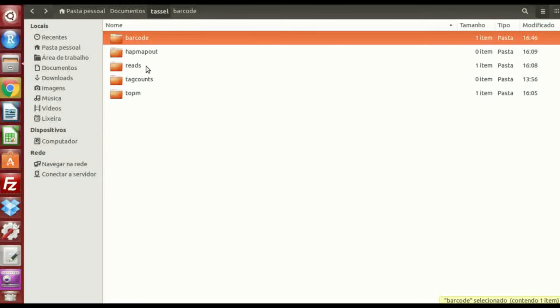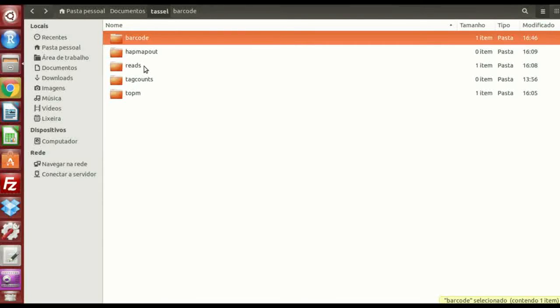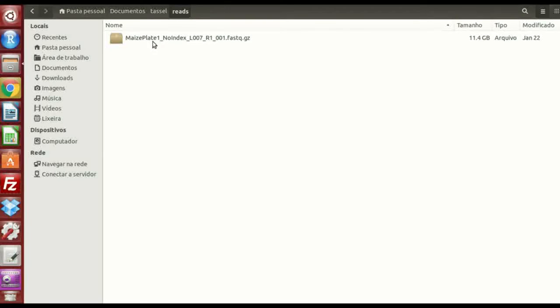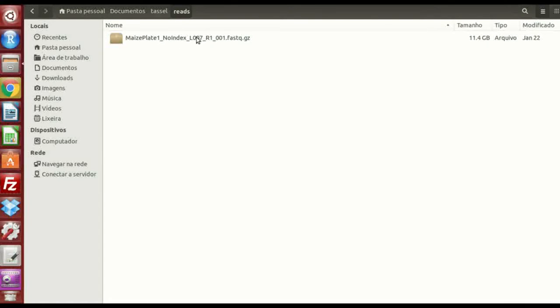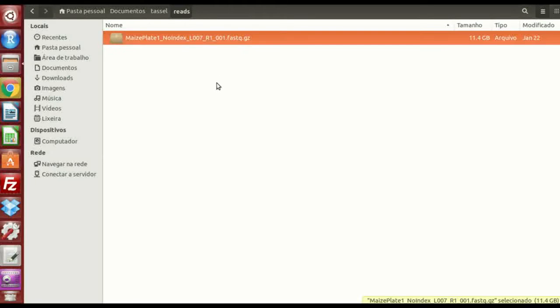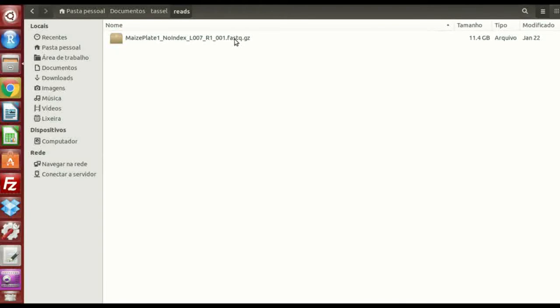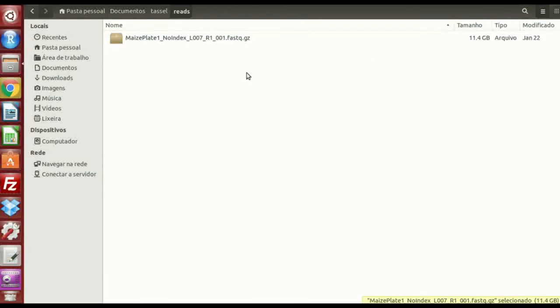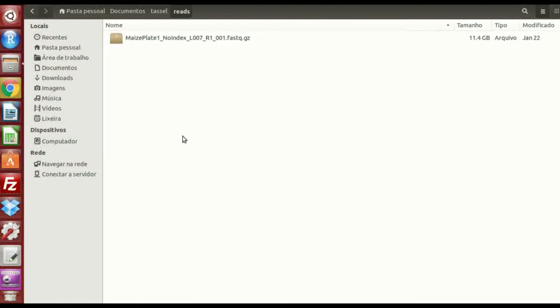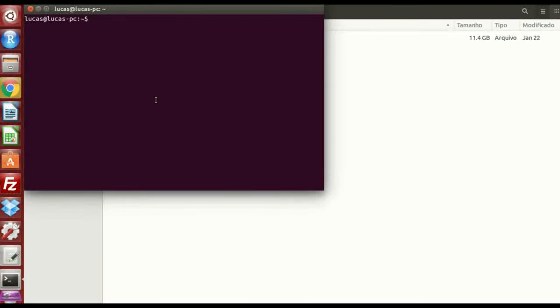My FASTQ file, which is what the lab gave me, it's in this file called reads, and it's compressed in .gz. I can't open this, it's 11.5 gigabytes, but we can try to give a command on Linux, and trying to find the flow cell name.